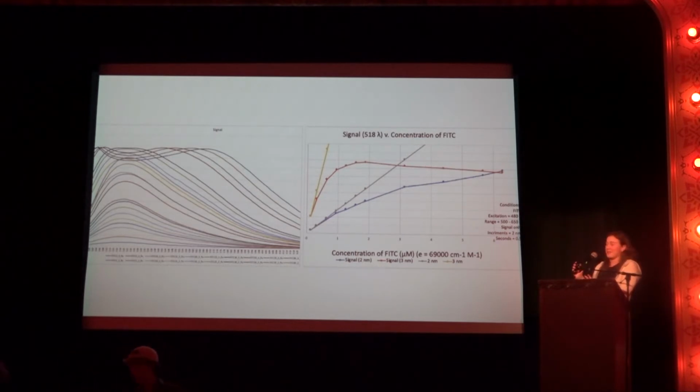Some more graphs. A lot of my internship was graphs. This was the fluorescence machine. So as you can see, there's a dip here, a little divot, which was not, again, supposed to happen, so we learned something new. And I measured all of these to get the correct fluorescence of them.